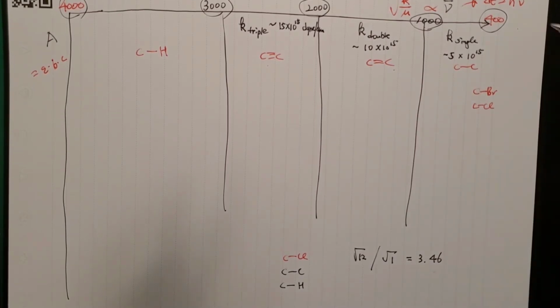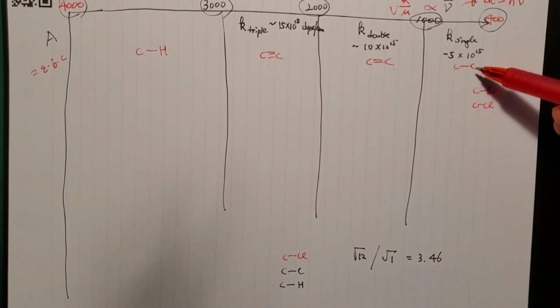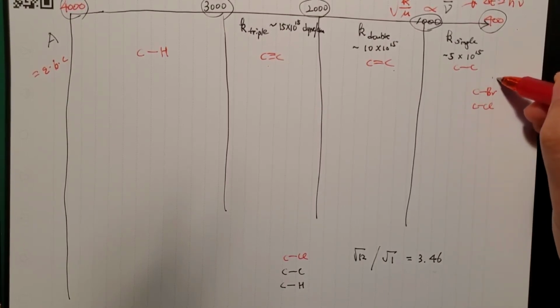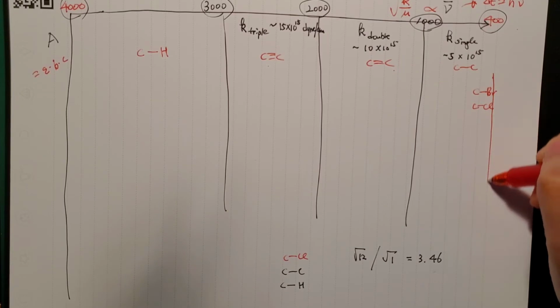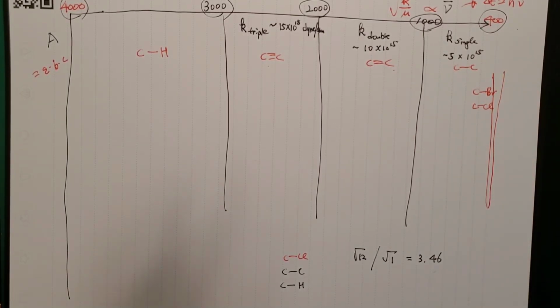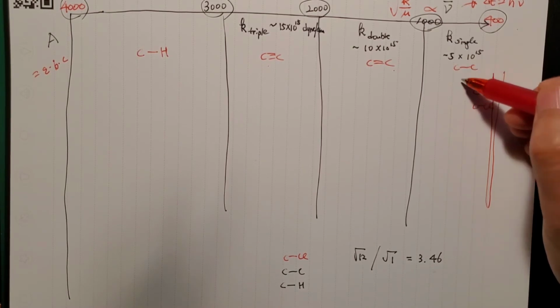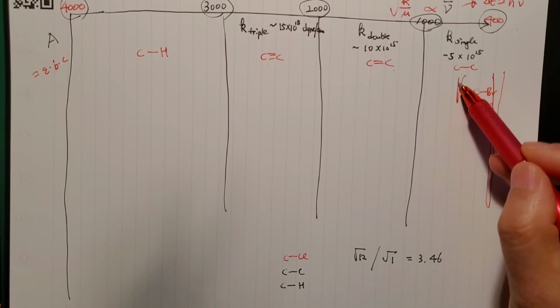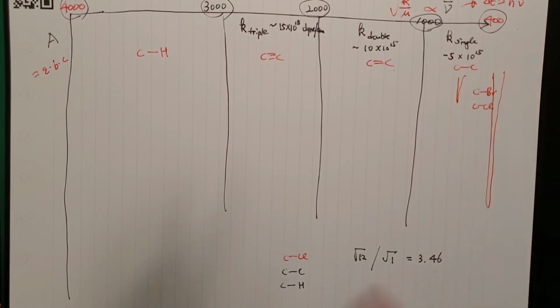But what else is changing? Carbons are almost neutral, but these bonds are polar. So the intensity of the signal increases by much, while the C-C single bond is a small peak with the bigger frequency value.